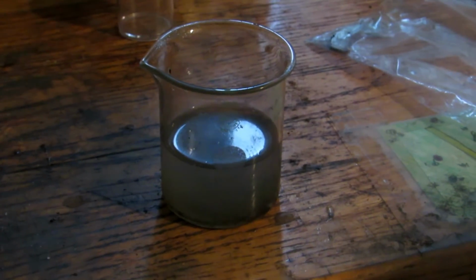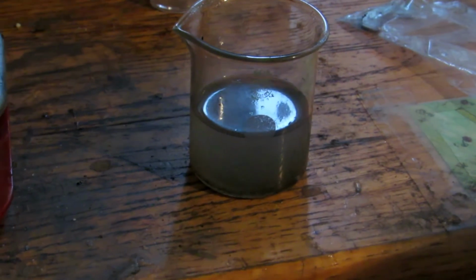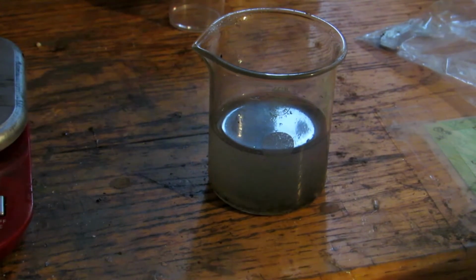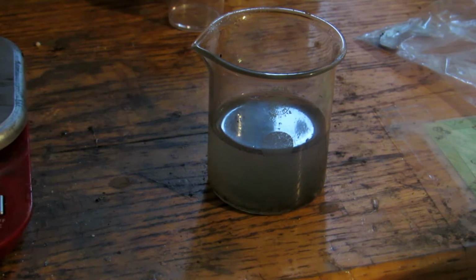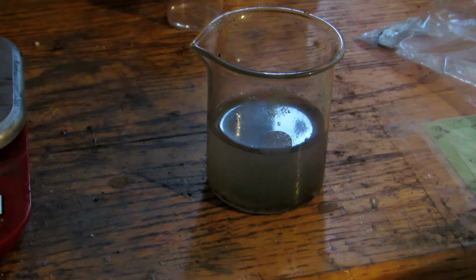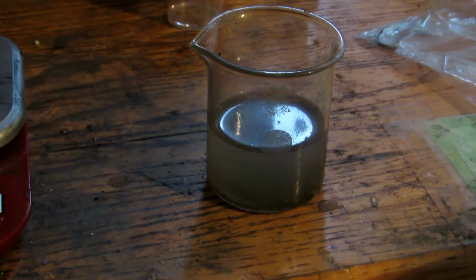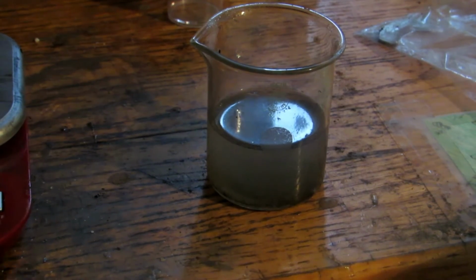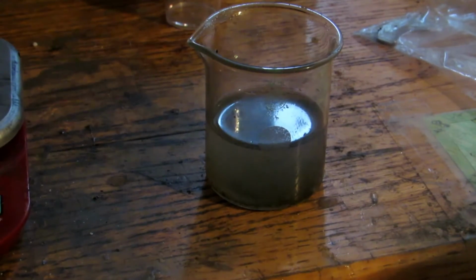Okay, so I only actually did end up heating up half of that because my arc furnace caught on fire. I have 3 transformers in it, and the smallest one always gets super hot. And I had just been using it before this video, and so it overheated because I wasn't paying too much attention, and that one transformer caught fire. But that's not a problem because the other 2 were totally cool because they are much larger, so I will just rewire a 3rd transformer and replace it later. But I cannot finish up with the rest of it right now. But that's fine because this is clearly enough for what we need, which is demonstration purposes.